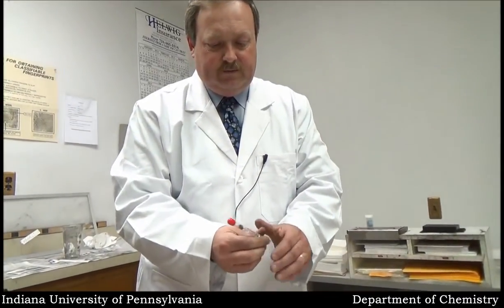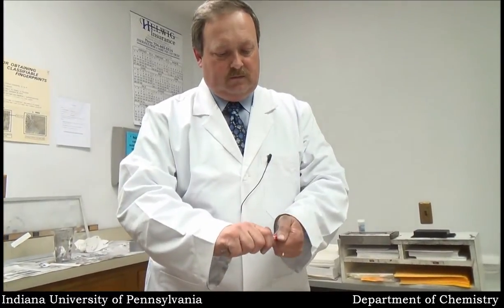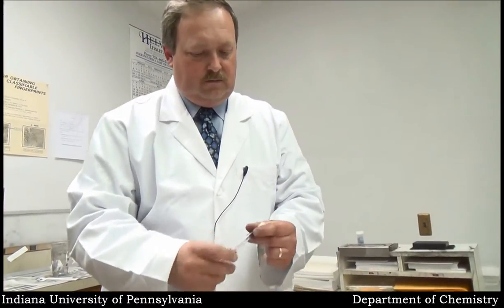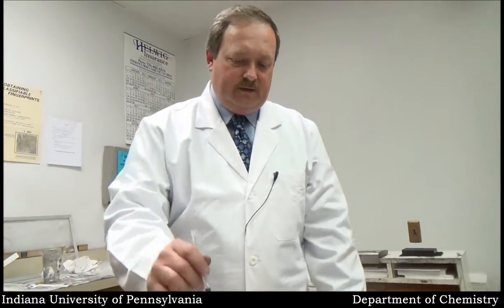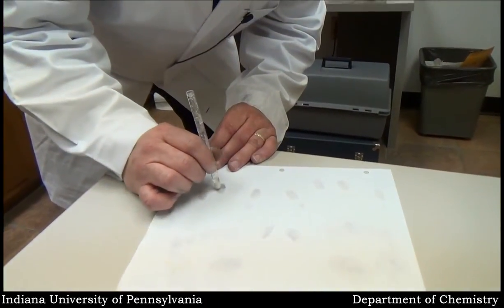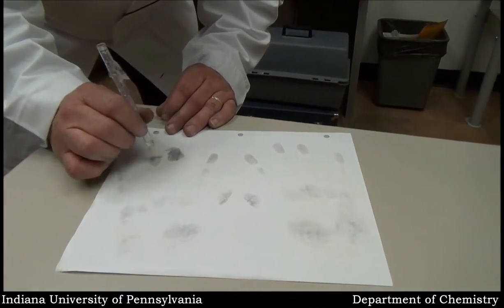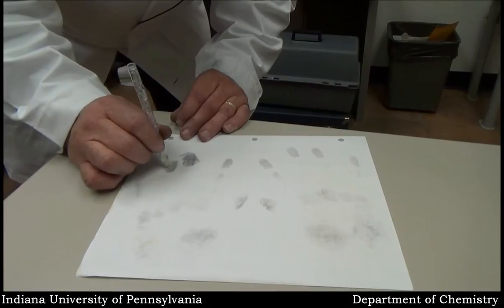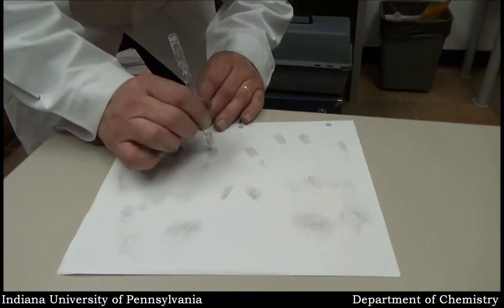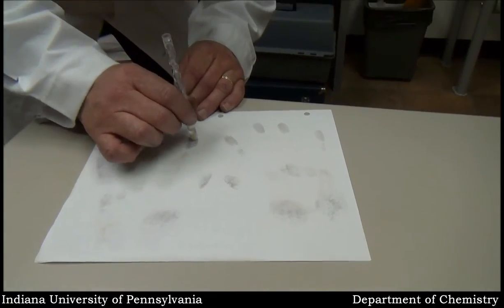So what we're going to do is take this product here — pretty much the same application. I'm going to break the ampules and give it a chance to mix. Basically we're just going to dab it and let it soak through the print. It may initially appear that it's causing it to disappear, but that's just because of the moisture on the paper. As the moisture dries, that print will be set relatively permanently.